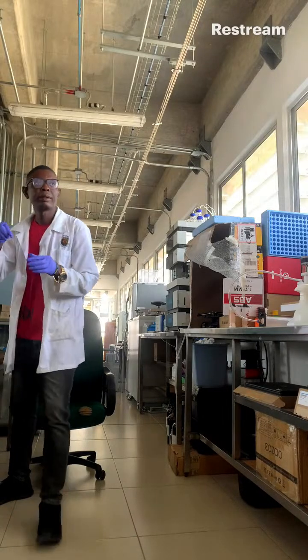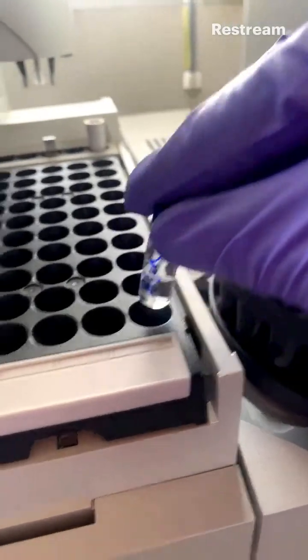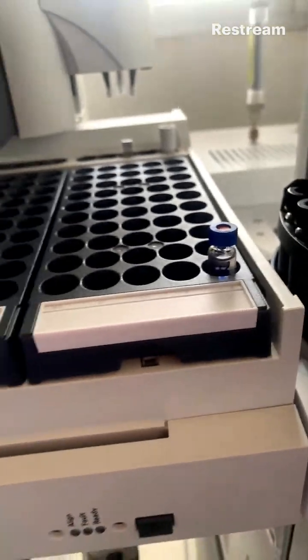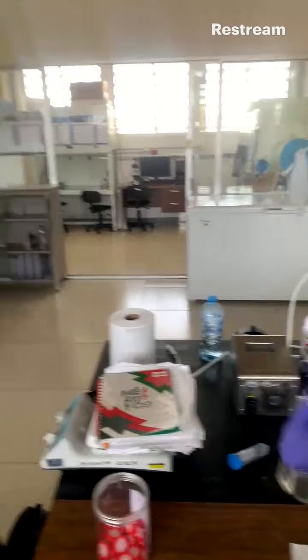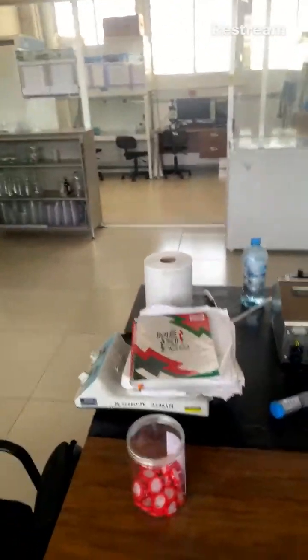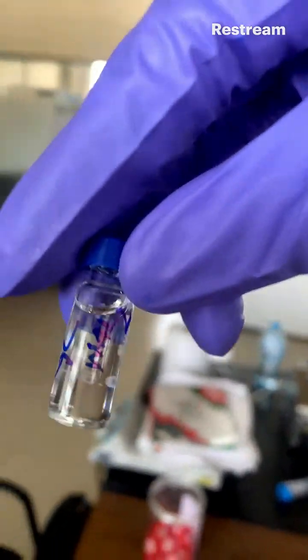This is my blank. So I will place my blank at position 1. This agave, no. This is GC banana, no. This is GC sodium aluminate.